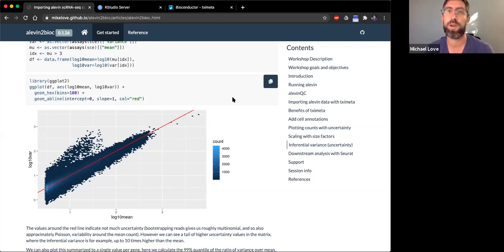Those are cases where we tend to think that the bootstrap estimates are giving us some important information. Depending on the actual method of the EM, or ways that we implement the EM, we can end up with kind of spurious zeros there. Usually they're the same, but there are cases where they're not. And I think it's important to take into account the bootstrap mean and variance.